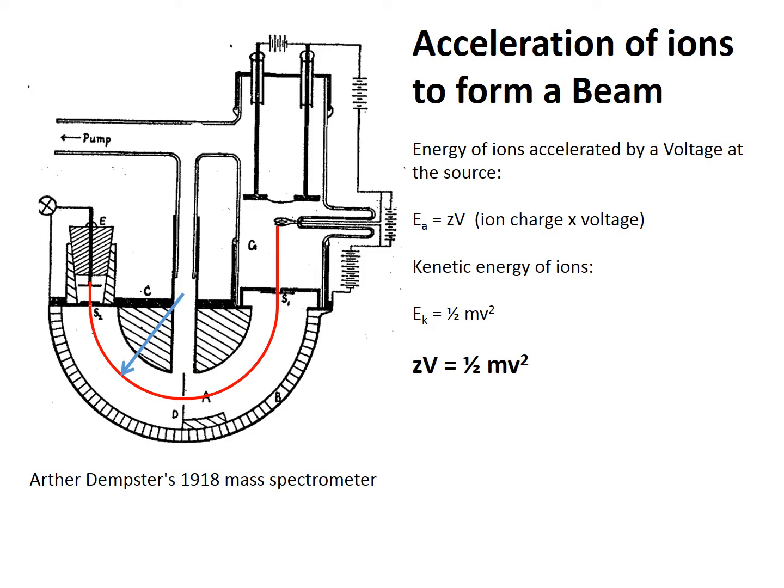This is a schematic diagram of, I think, one of the world's first mass spectrometers back in the early 20th century, and this doesn't have a plasma source. It just had a filament like an old-fashioned light bulb. Do you remember light bulbs that had filaments? When those filaments get really, really hot, they start to give off ions from their surface, especially if you put a sample on them. This system has a really, really high voltage behind the filament, and that repels the ions away from it. There's something clever to focus them into a beam, and we have a small hole here. So we create a beam of ions coming into this region of the mass spec.